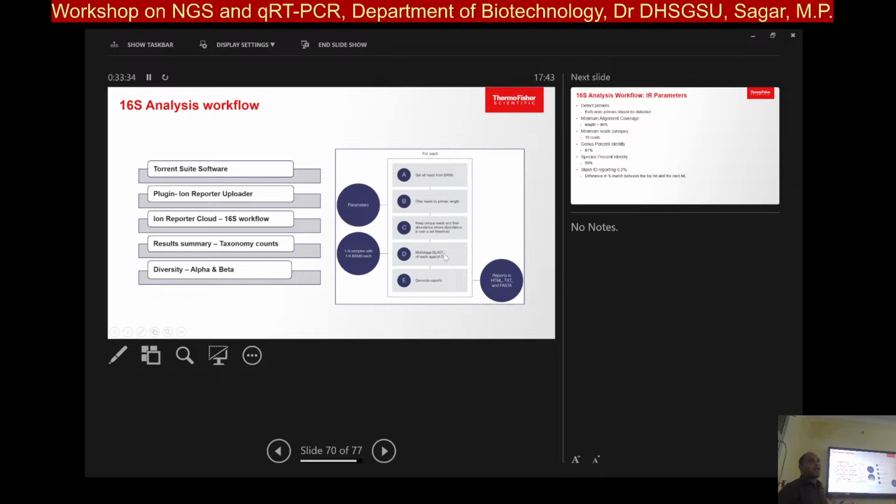अब उनके पास लैमिनार नहीं है, समझो, example I am just giving. So he is not doing it on laminar. वो एयर जो आ रहा है ना, वो भी वहां पे एक्सट्रैक्शन में आ रहा है, और जो एक्सट्रैक्ट हो रहा है विद द पीसीआर, ओके, वो वहां से आ रहा है, सीक्वेंसिंग हो रहा है, और रिजल्ट्स पे भी आ रहे हैं. तो वहां पे सबसे ज्यादा भर के सुडोमोनास आ रहे हैं. That's how it is happening. I am just giving an example.